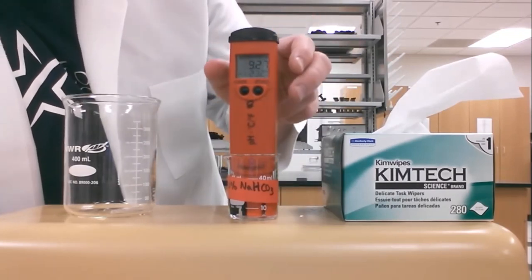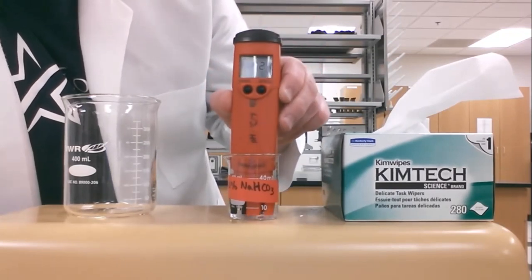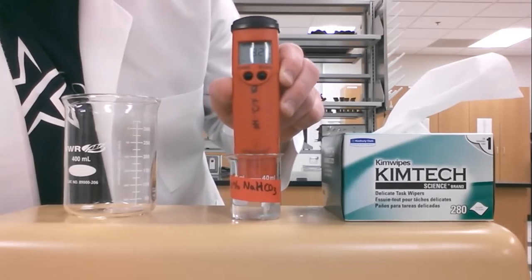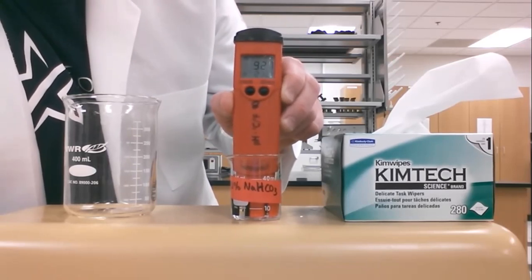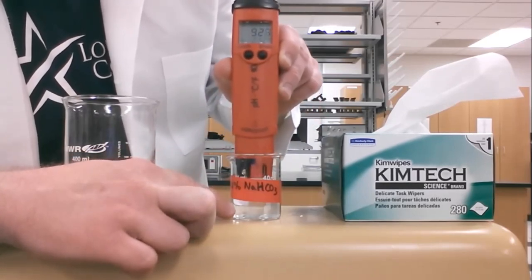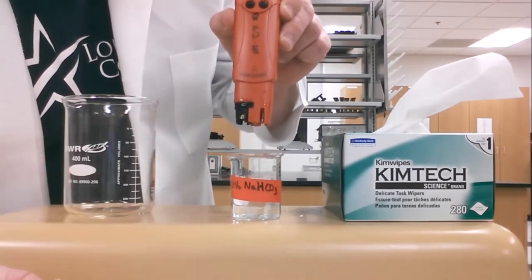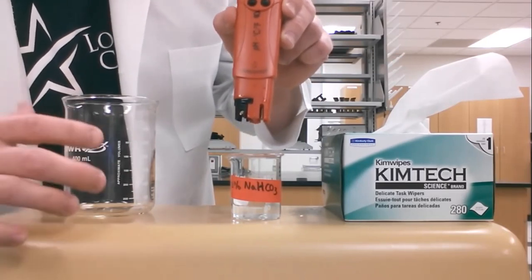Anytime that you're going to change solutions or put the cap back onto the pH meter, we're going to have to rinse the electrode because we don't want to keep any of the things that are inside the solution that you're measuring the pH of. We don't want any of that stuff to be stuck on the electrode because that's going to wear it down and make us not able to use it in the future. So we're going to rinse that.